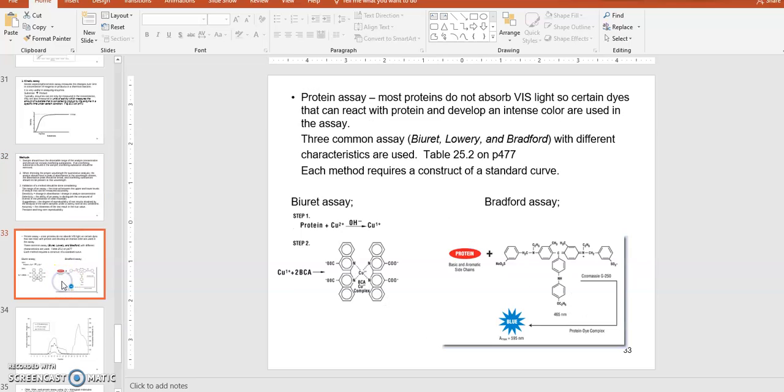Okay, and then protein assay, going back to that, we talked about Bradford assay using the Coomassie brilliant blue dye molecule G250 that sticks well with the protein and it absorbs the blue light very well. But besides Bradford assay, there are two different kinds, like Biuret assay or Lowry assay. Okay, Biuret looks like this. It has copper in it, so it gives kind of a reddish color. And Lowry will give it another color as well.